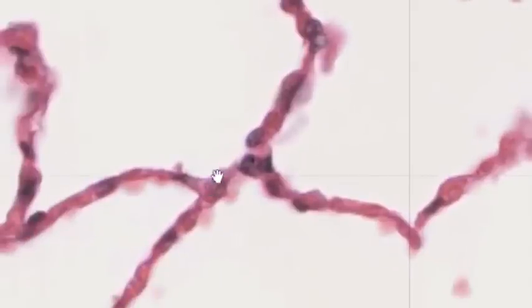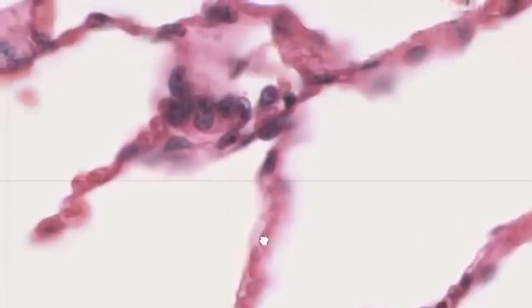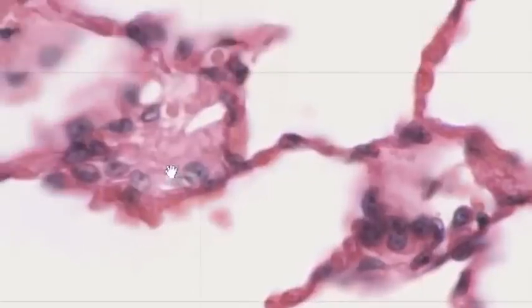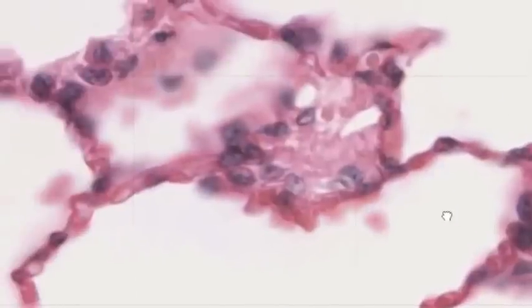Interspersed among the flat squamous type 1 pneumocytes are type 2 pneumocytes — fatter, rounder cells with much larger nuclei, often found at the interstices where two or three alveoli meet. Type 2 pneumocytes secrete surfactant, the liquid material that breaks surface tension and prevents the alveoli from remaining glued closed after exhalation. At some interstices there is also additional structure, including fibroblasts and patches of connective tissue.